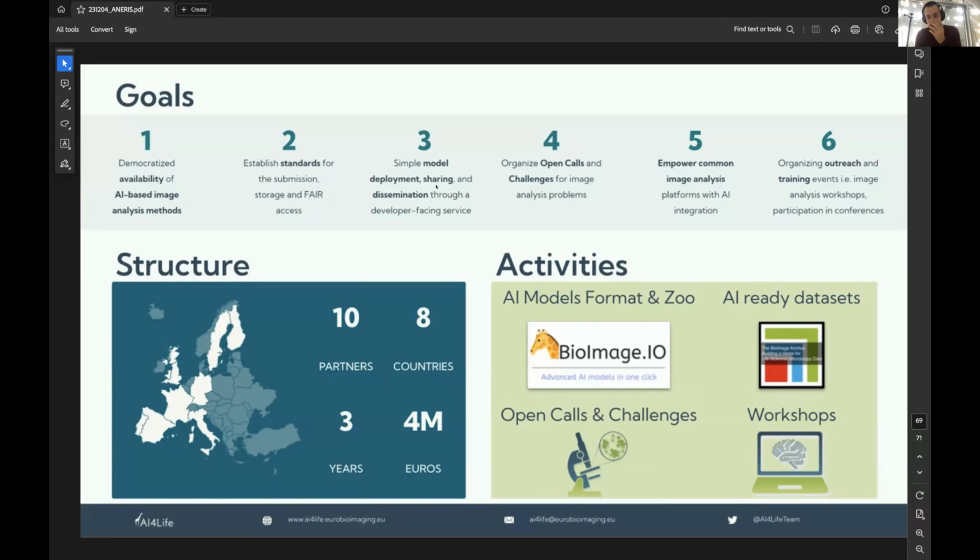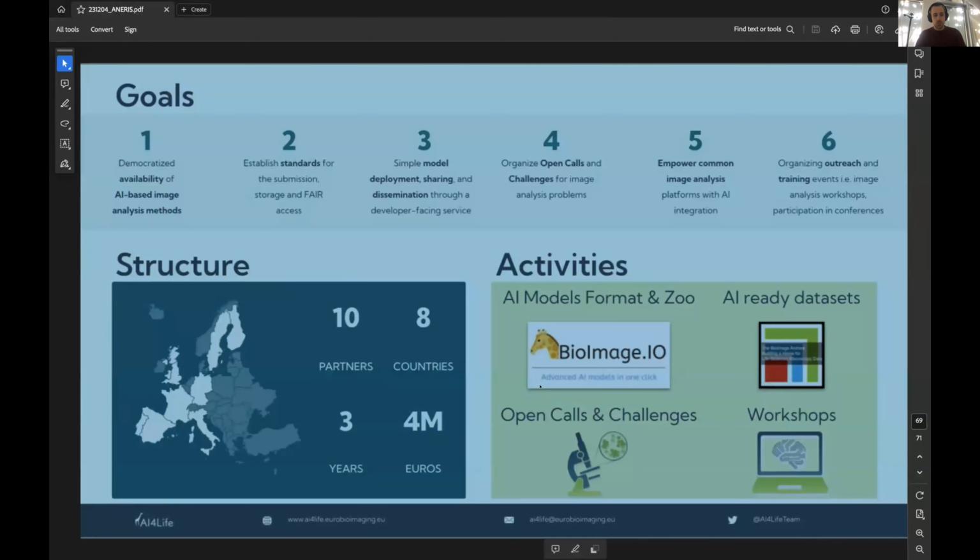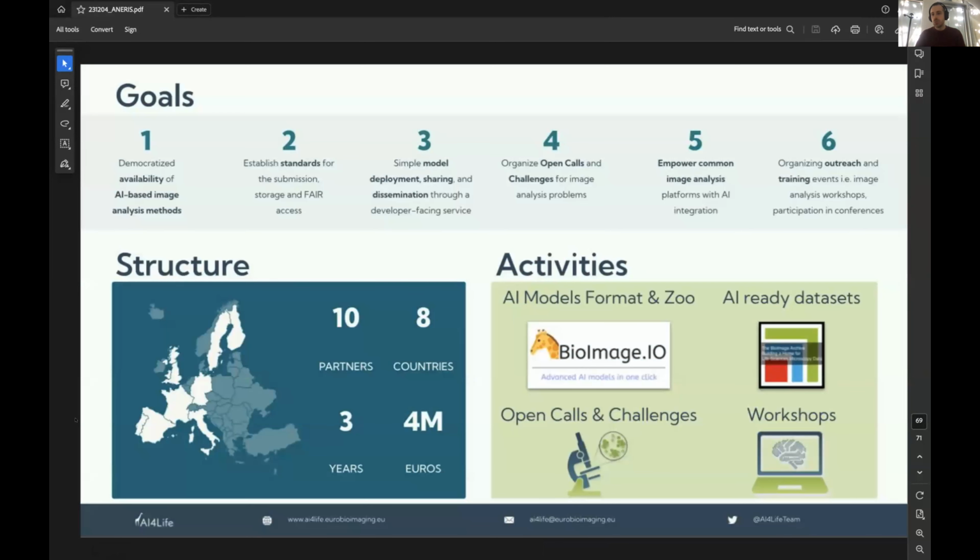So as far as the napari plugin goes, there is some description of all the parameters. I usually don't change them so much. You want to change the epochs and the steps for the length of the training, and then you want to change the patch and batch, so P and B, to set basically the memory footprint on your GPU, because this is usually the first error that everybody will encounter: you set the parameters too high, and then your GPU memory is just too small for this. But usually the more advanced parameters we do not change so much, and then there's some description and documentation on how to use them.